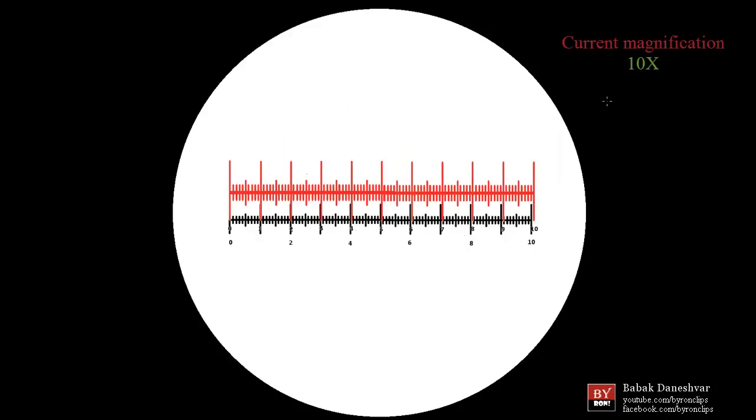So now I've gone ahead and superimposed the ocular ruler on the stage micrometer using the stage knobs. And the concept is rather simple. By means of comparison of the ocular ruler against the stage micrometer, the length of which we already know, we will get an idea of what each ocular unit corresponds to in terms of physical dimension. So we already know the manufacturing factory has told us that the entire length of the stage micrometer, the red ruler here, is one millimeter. One millimeter as you might know is equivalent to 1000 micrometers.